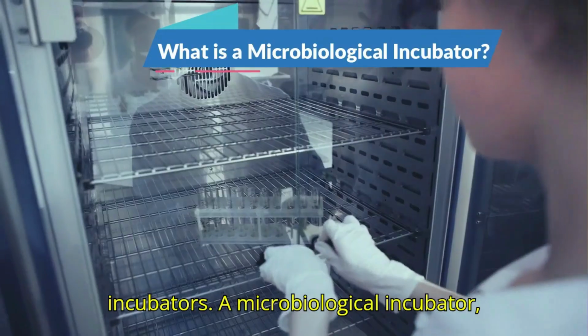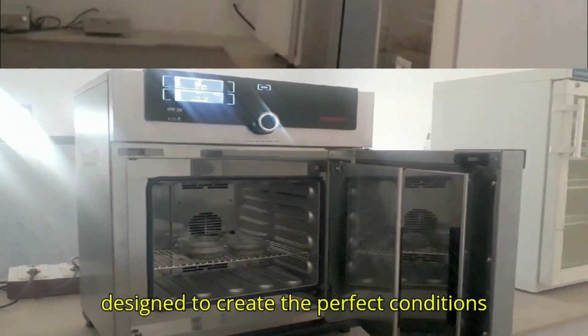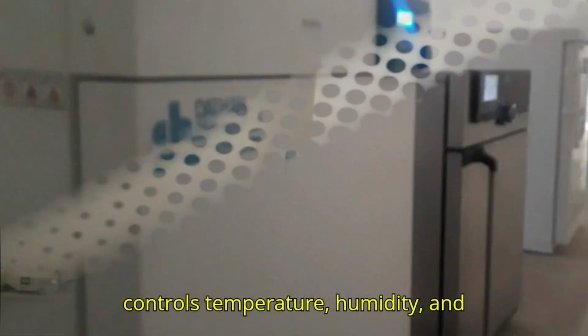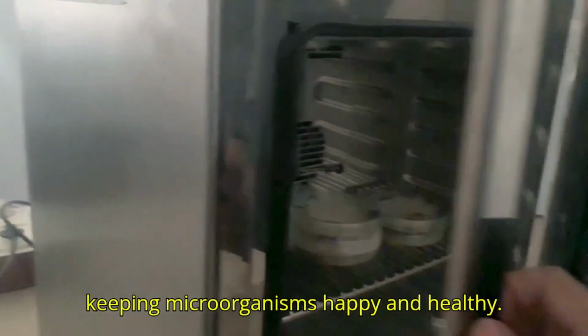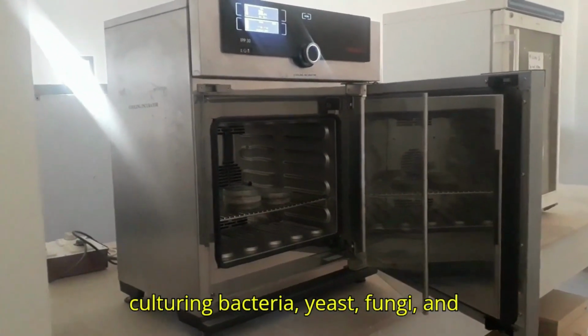A microbiological incubator, often called a standard incubator, is designed to create the perfect conditions for microbial growth. This device controls temperature, humidity, and sometimes CO2 levels, essential for keeping microorganisms happy and healthy. It's widely used in research labs for culturing bacteria, yeast, fungi, and even cell cultures.